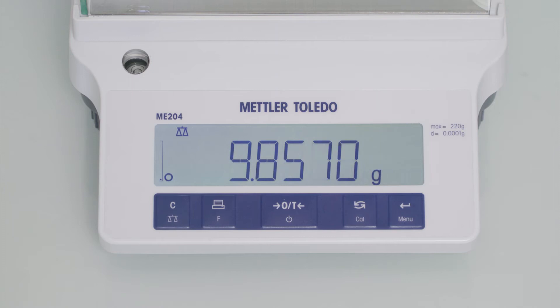A bright and clear LCD display with large digits makes the balance easy to read under all lighting conditions.